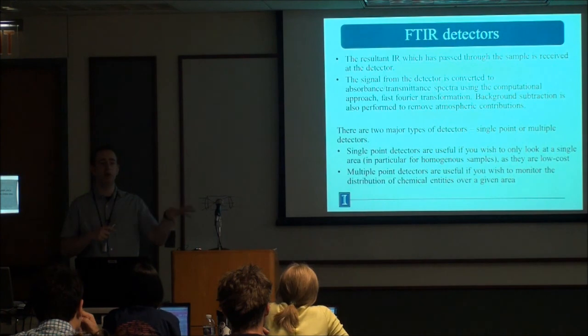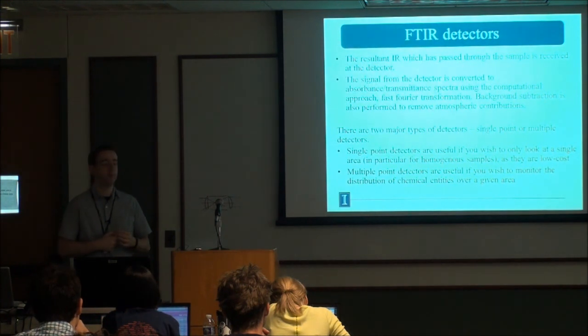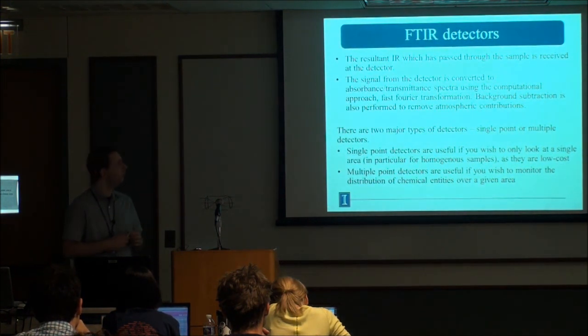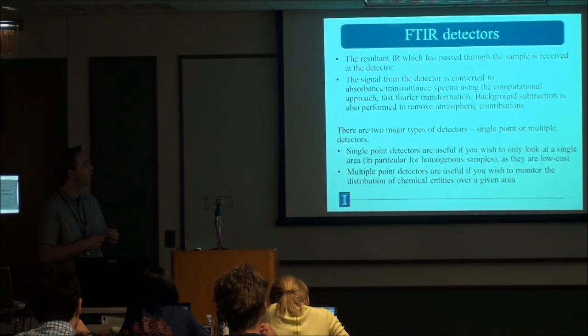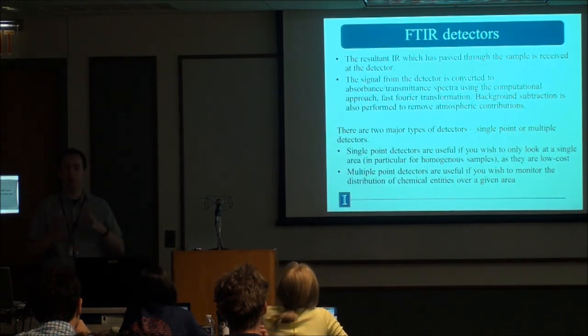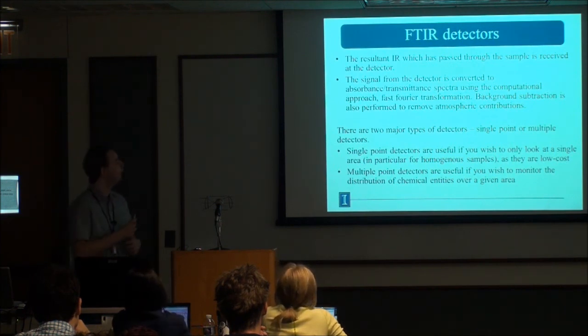So last week, actually, you were working on the Spotlight, which is a linear array. The one next to it, the big one, was a focal plane array. These were actually originally developed by the military for weapons guidance for missiles. They declassified those in, I think it was early 2000, and now they're relatively widely available. Certainly in the US, they're widely available. It's a little bit more tricky in Europe, and certainly in Asia.